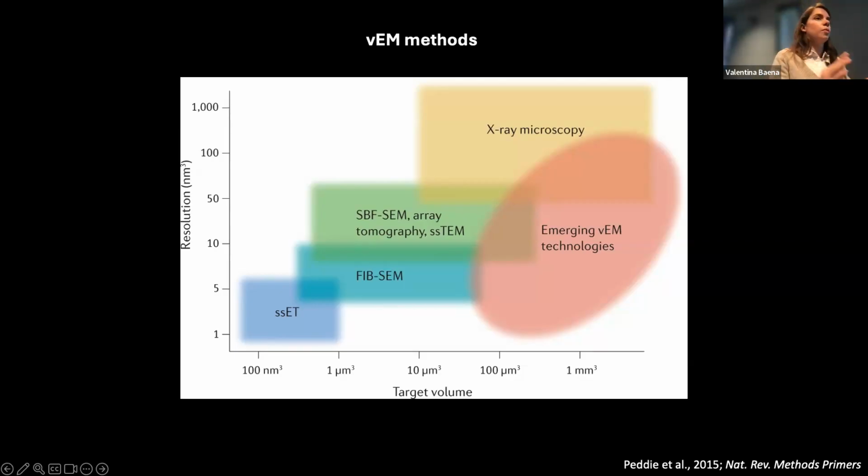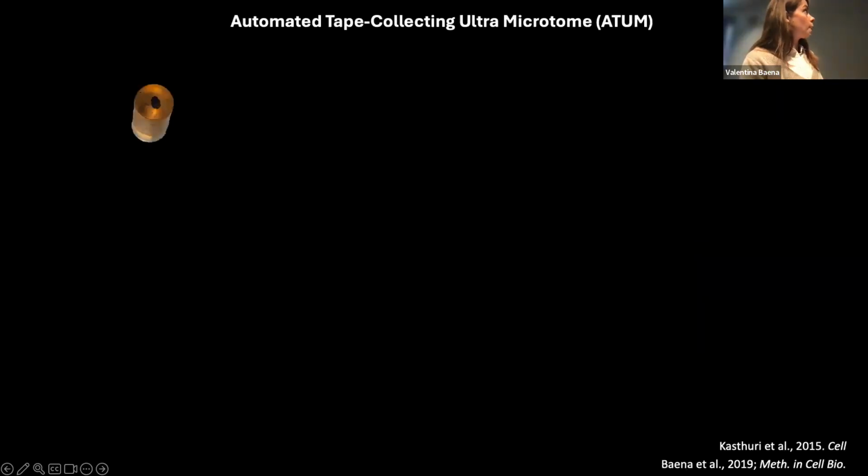So if you're a very good ultramicrotomist, you can probably go down to 30 nanometers per section. It's quite difficult, but if you are able to do that, the data quality improves dramatically. Otherwise, resolution per section, 60, 70 nanometers is also enough, and I'm going to show you a little bit of that data as we move forward.